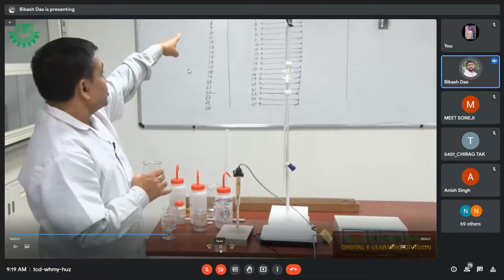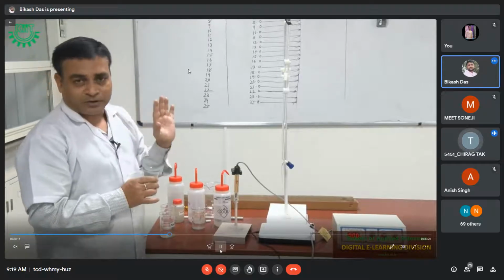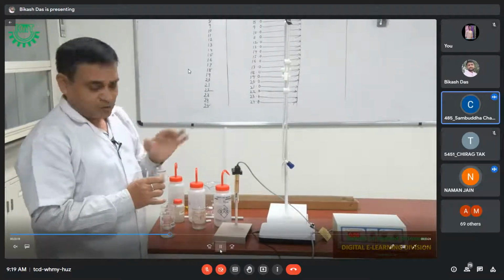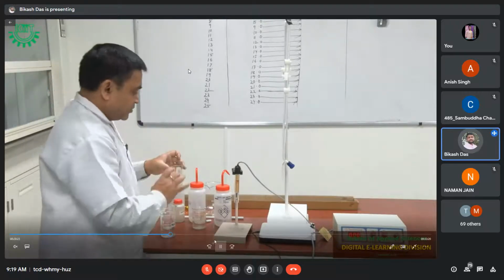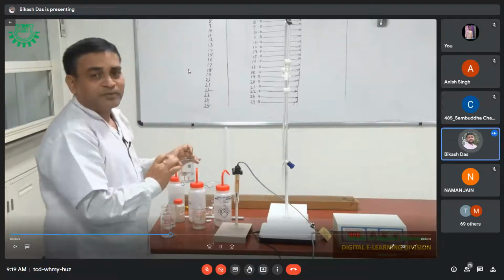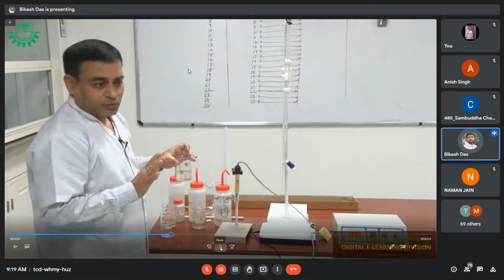Students, all of you understood? Yes, sir. Class? Okay. Yes, sir. Okay. Now see what sir is going to do: in this same beaker, the 50 ml that we pipetted, now to these solutions we have to dip the electrode and measure the conductance.